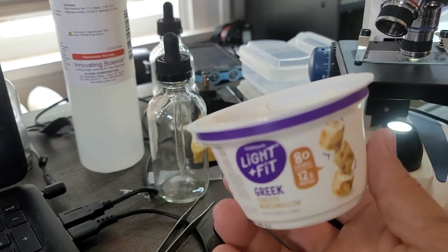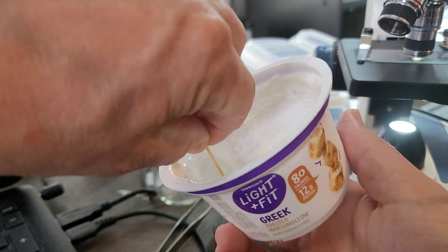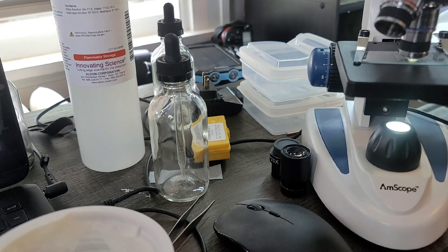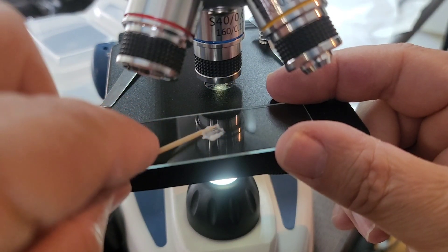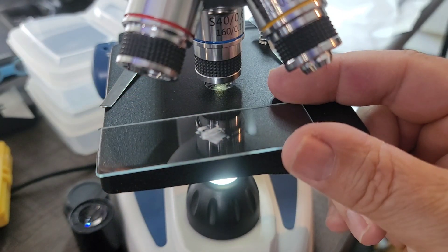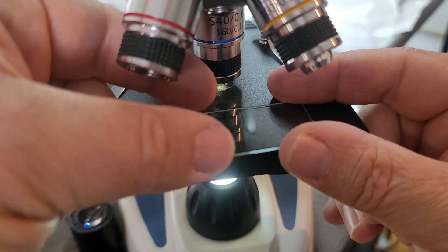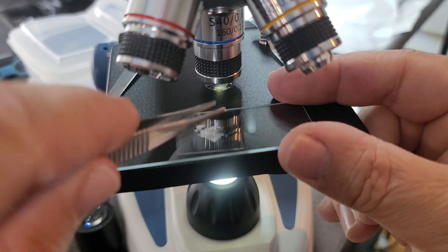We're going to take a look at Greek yogurt under the microscope. We'll get a little bit here and put it on a slide — that should do it. Put a cover slip on and smash it down.